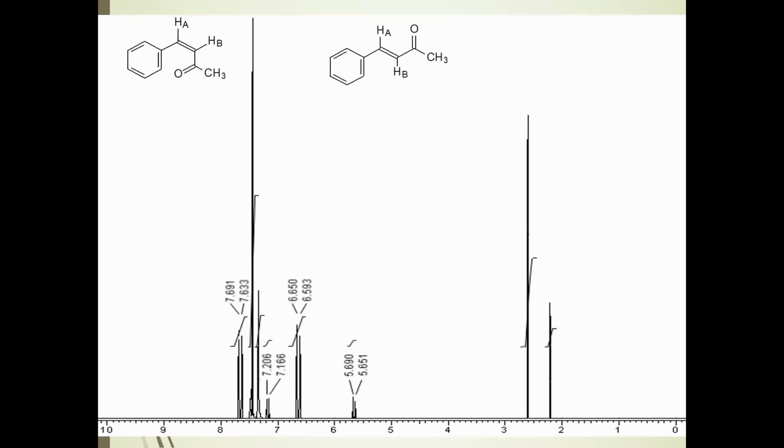One more example, this is actually a mixture of cis and trans, and you can see that in that we have 2 smaller doublets here, and then 2 larger doublets. Color code those. So one of these is cis, one of them is trans. And again, for the aromatic peak and for the methyl peak, we've got taller peaks, and we also have smaller peaks. So the smaller ones would be one isomer and the taller ones the other isomer.